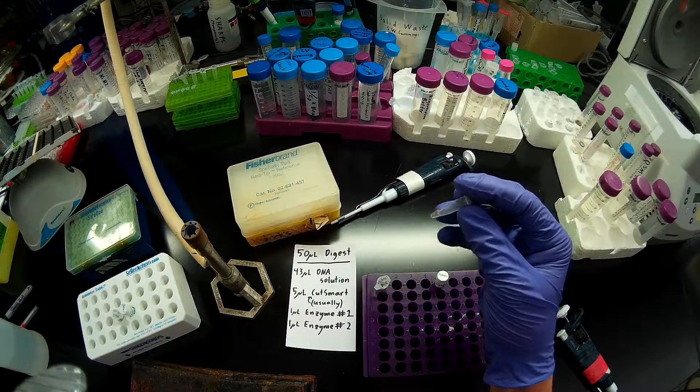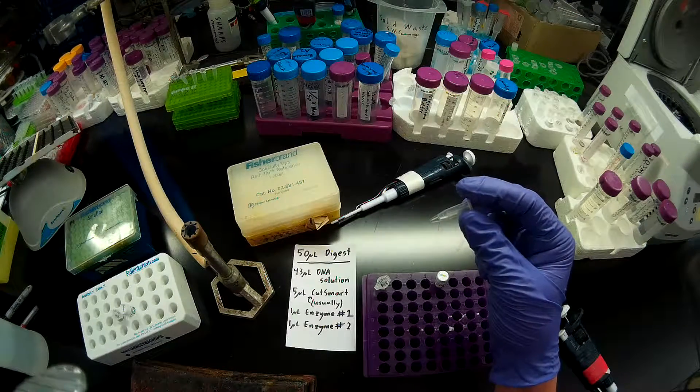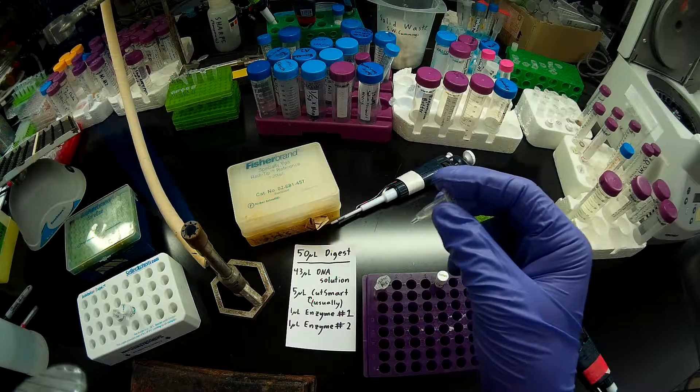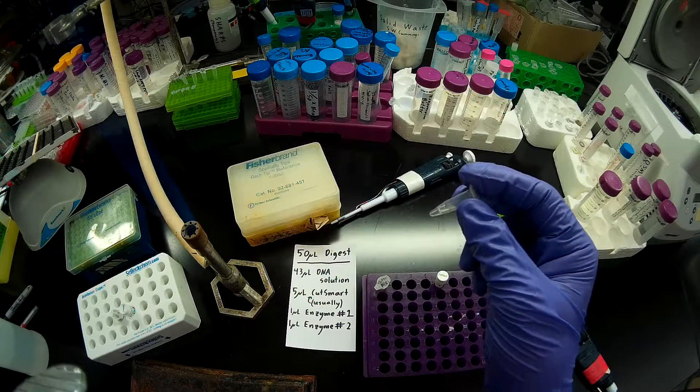Typically we want to dilute our DNA sample after we take it from our prep, but I did an extra desalting step to make sure that this would be pure. So I'm just going to take my 43 microliters of DNA directly from my PCR prep and add restriction enzymes to that.